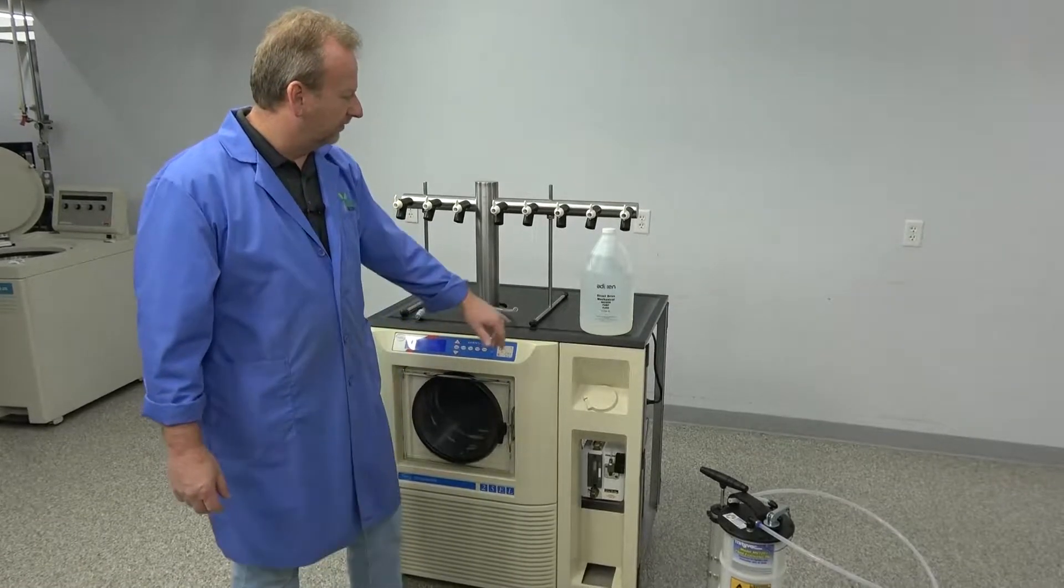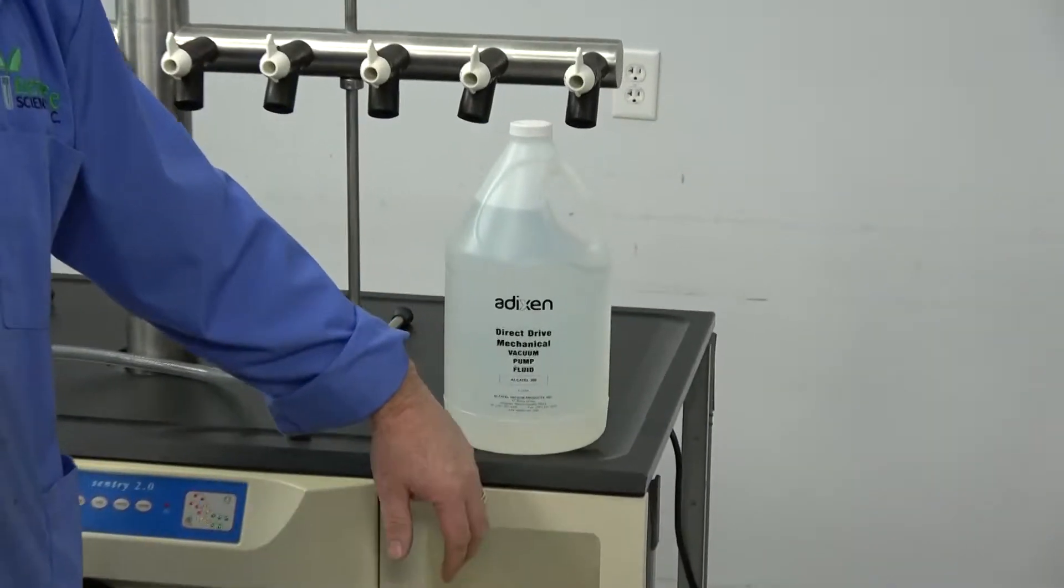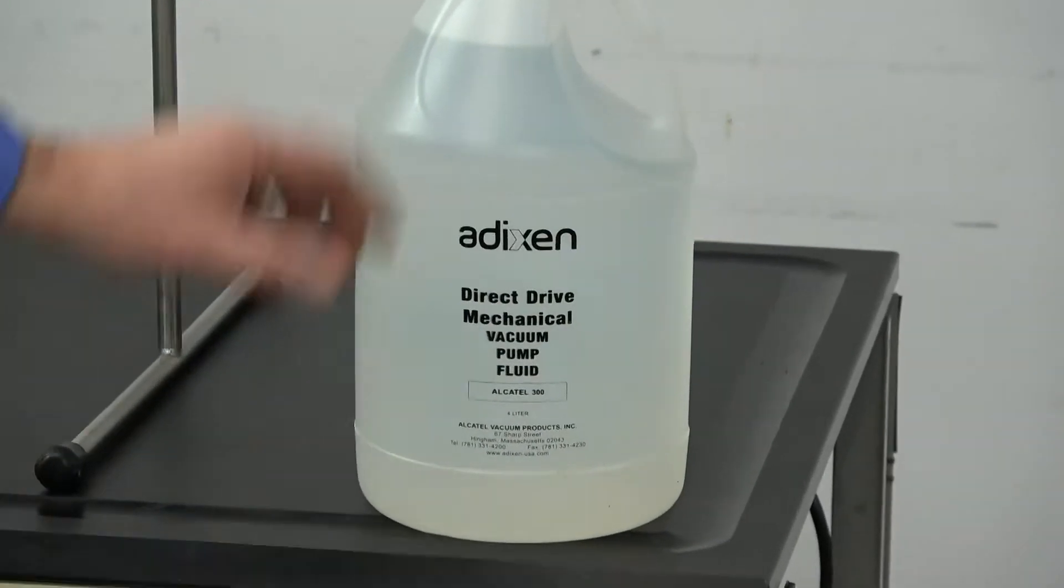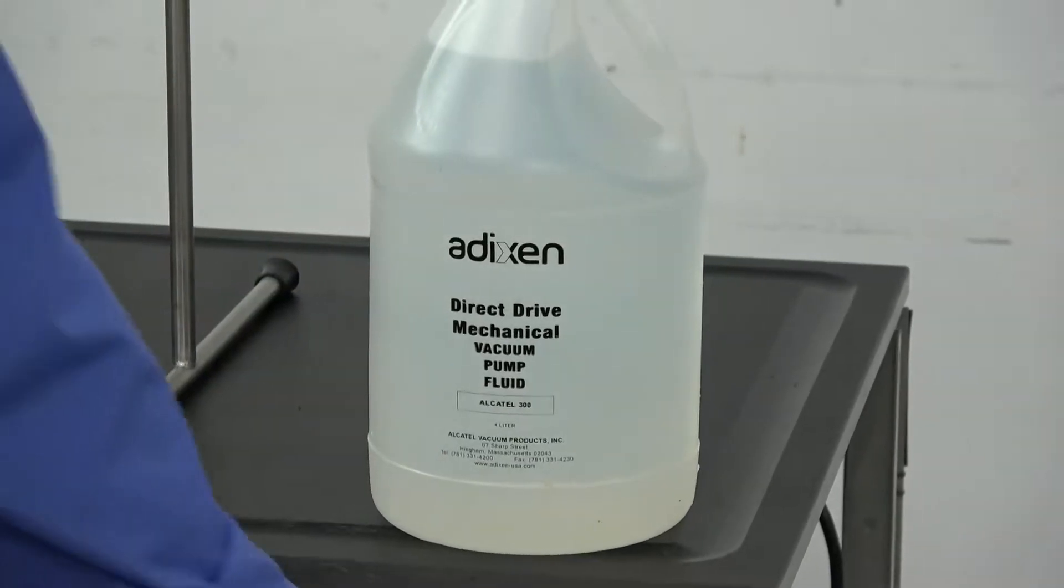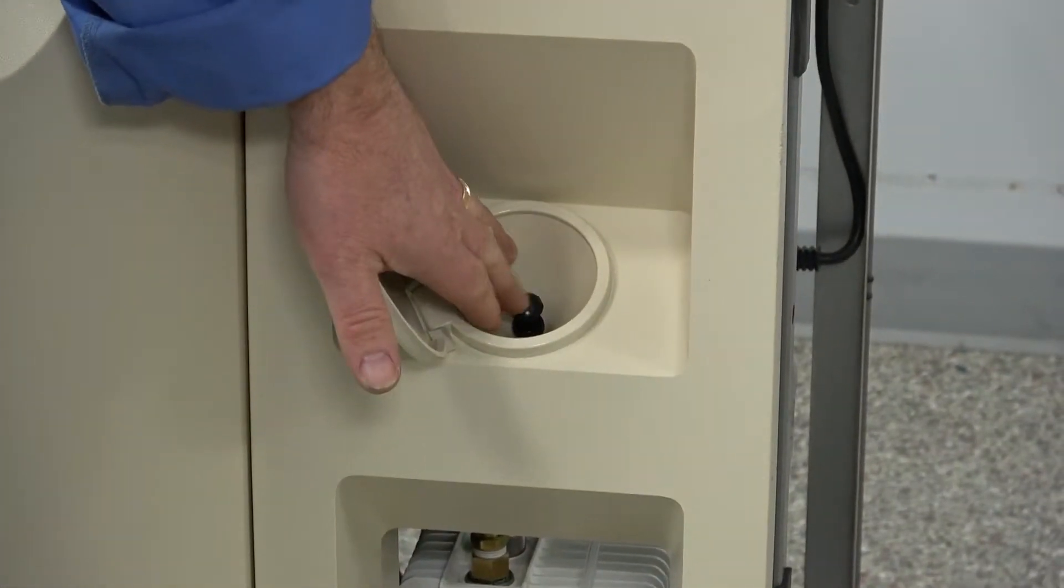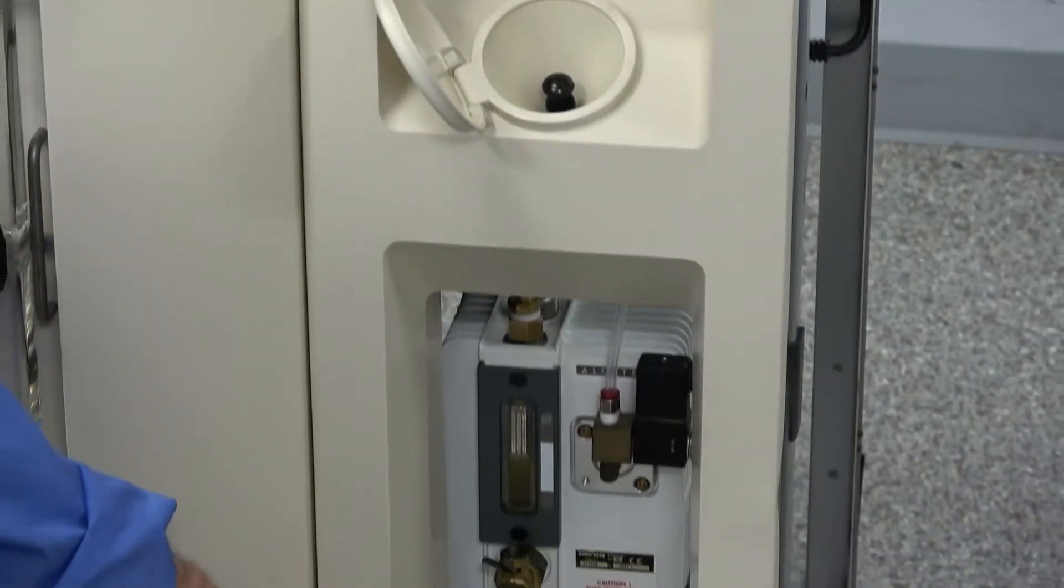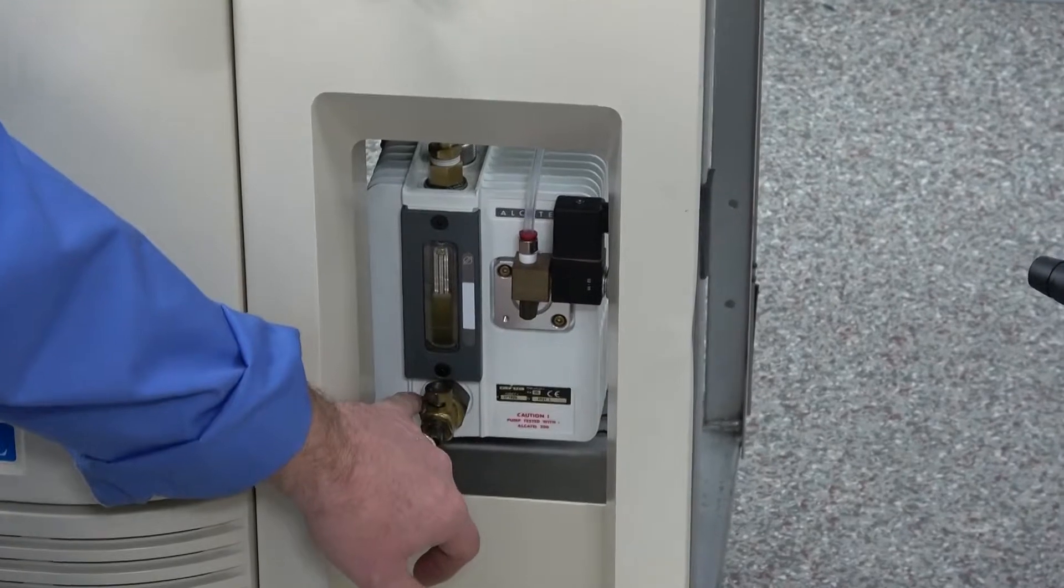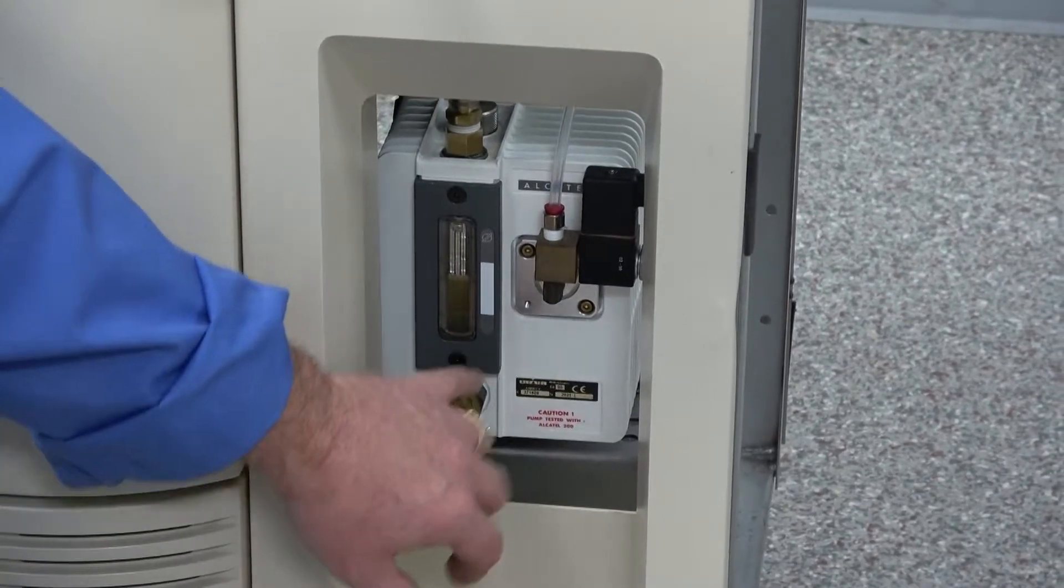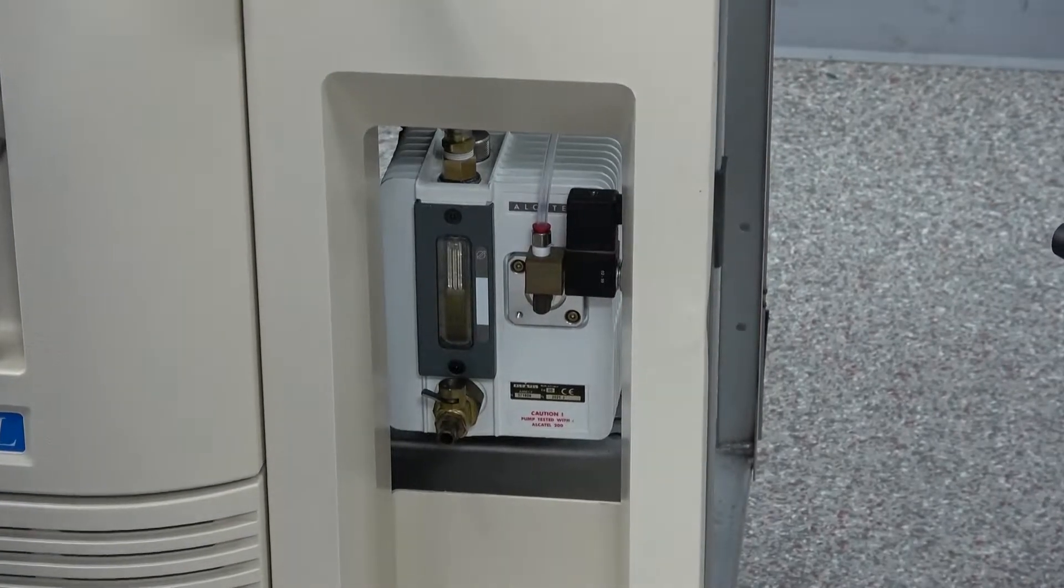But right now we've got the Addixson direct drive vacuum pump oil that we use in these because we use the Alcatel pumps. And of course, we've got down here the spout with the plug that we'll be removing when we're adding. And down here, of course, we've got the pump with the quick valve open here. But the pump is nice and warm. It's actually running right now. We're going to shut it off before we change it.